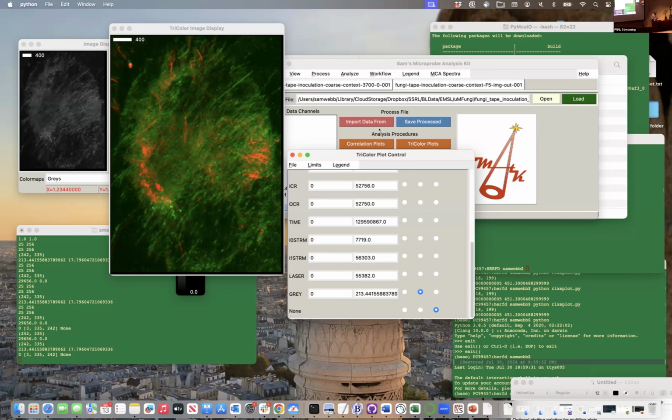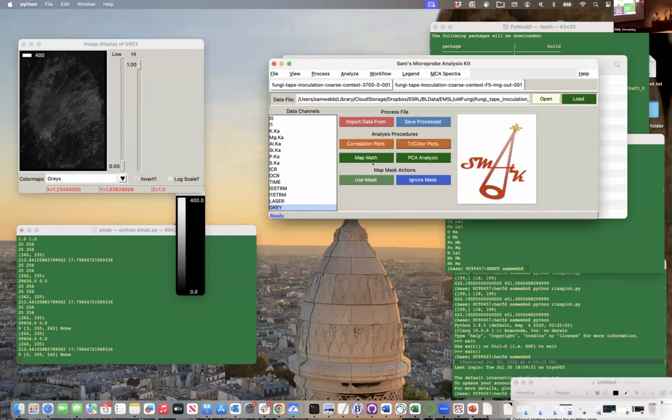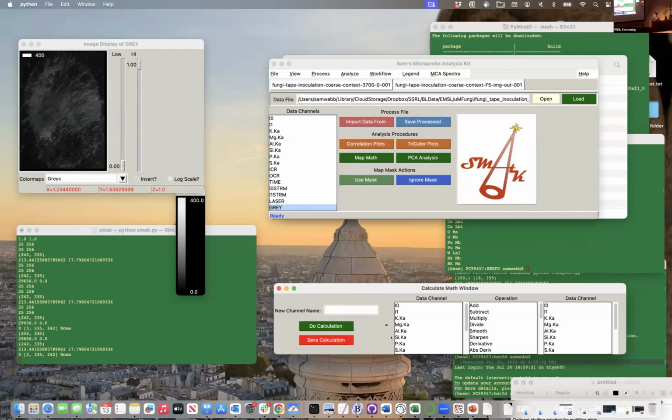You can do some crude measurements in the math section. I can choose a channel, and quite often I have to do, at worst, a quick horizontal and vertical shift a few pixels left and right to match that up. Luckily, right now we're doing okay.